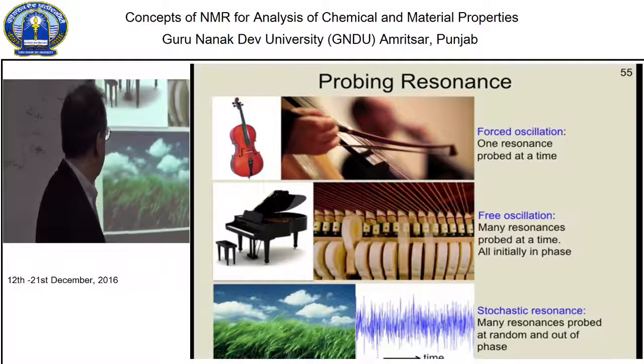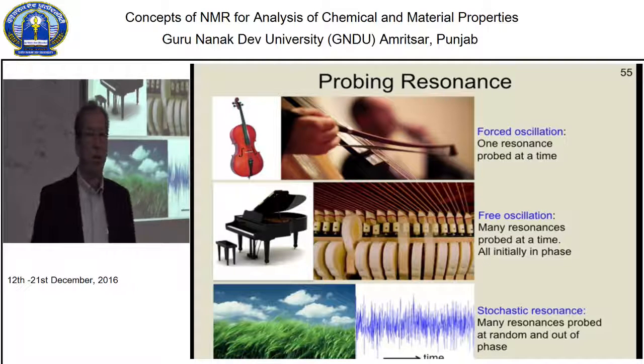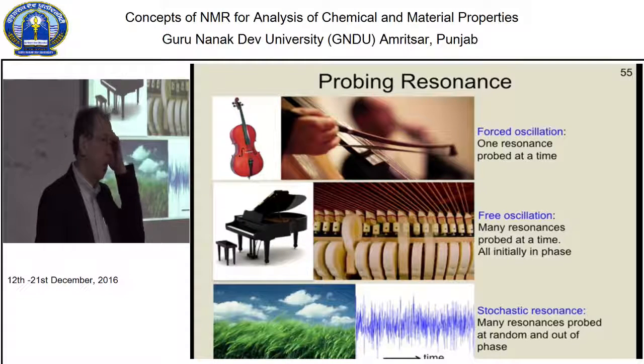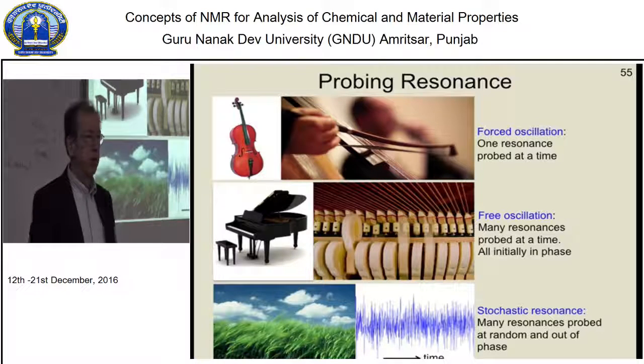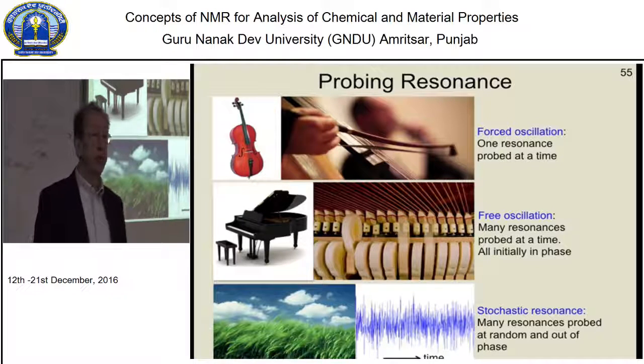And then it looks like regular noise. Why would you ever want to measure a signal like that? This is the most crazy way to measure spectra. And yet, it is the basis of Fourier infrared spectroscopy. This is a machine where you put your sample in, press the button, get the spectrum. And nobody noticed it.